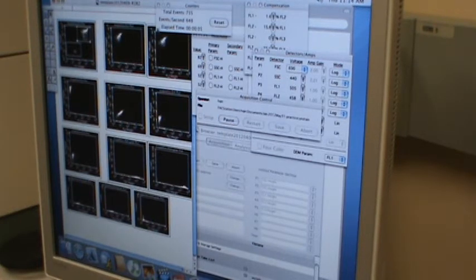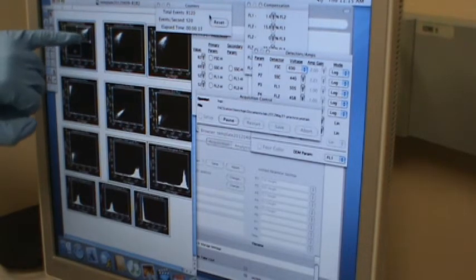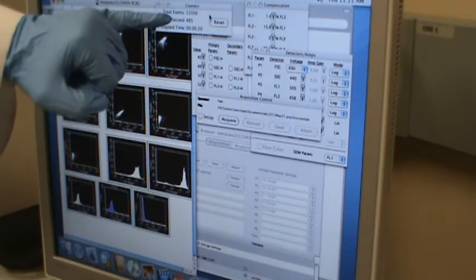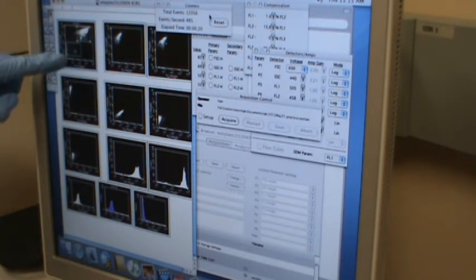Acquire. Okay, you see the counter: 700, 1400, 21. When will it stop? It stopped probably somewhere more than 10,000, because you see also there's some dots there. Look at dust. But it's not counting the dust, it's only counting everything inside of there. So you see, now it stopped at 11,000. So there are about 1,000 outside of that. Right, okay. Good.